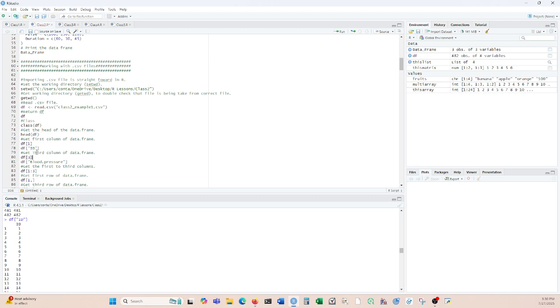And then I'm just going to show this once again. If I want to get the third column, just put in 3, and then I'm going to make this easier on myself to clear it, and zoom all the way. Now we got the third column again, or you can just do the name. And you see, the same thing happens.